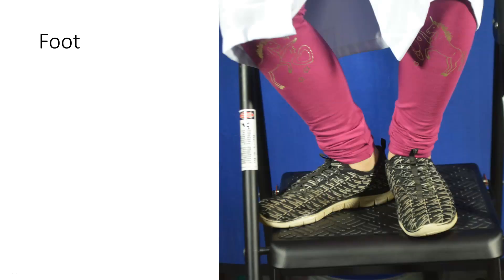Last thing we look at is foot protection. In a laboratory, you should always have foot protection, and the foot protection is going to keep stuff off of your feet. In a microbiology lab, normally we worry more about aerosols or things dropping down, and we don't want to expose bare skin on the feet, and therefore we would put foot protection on.